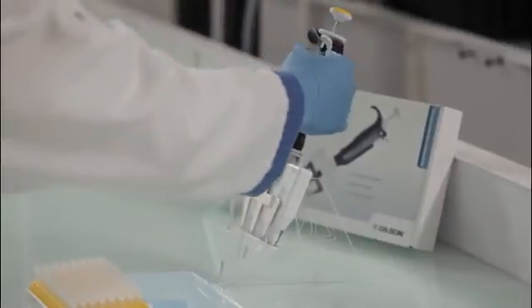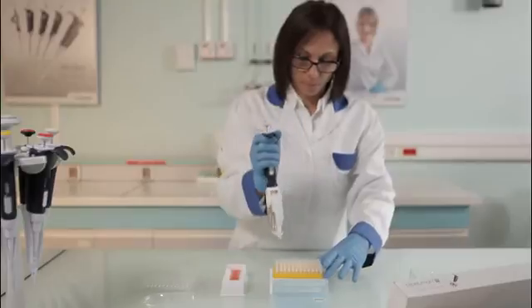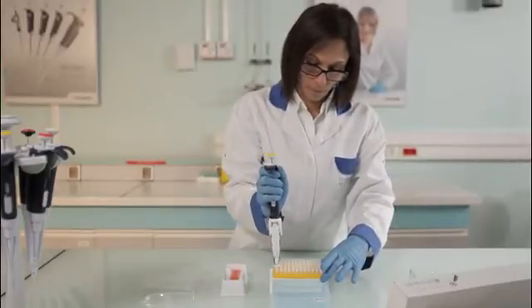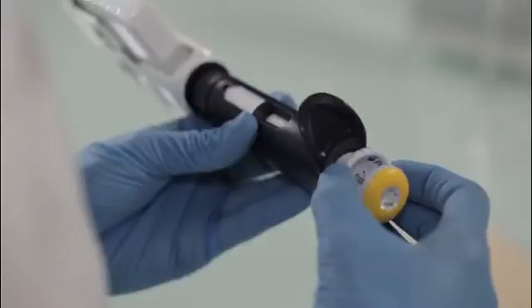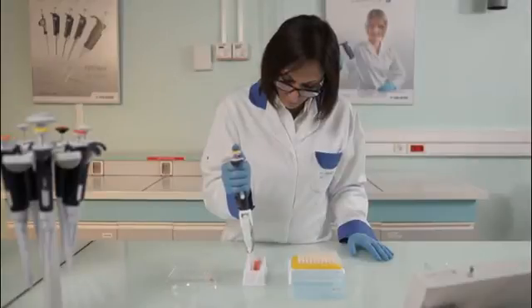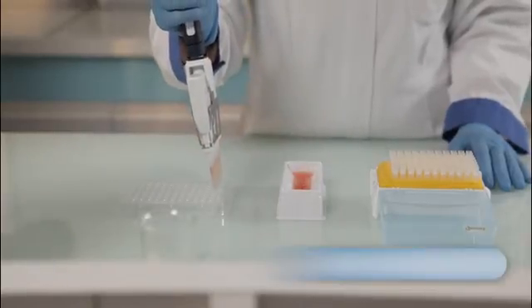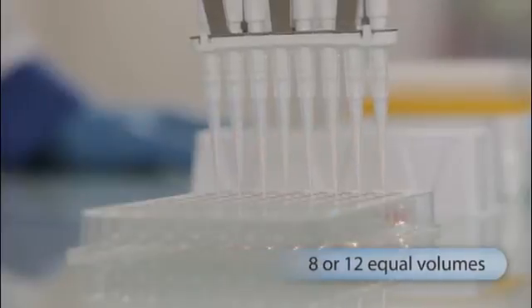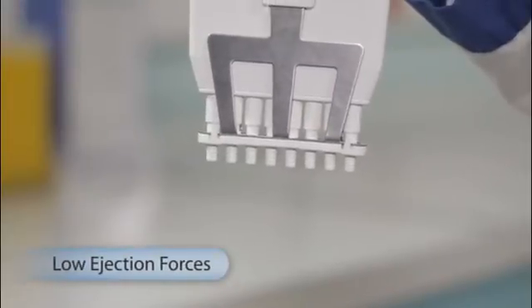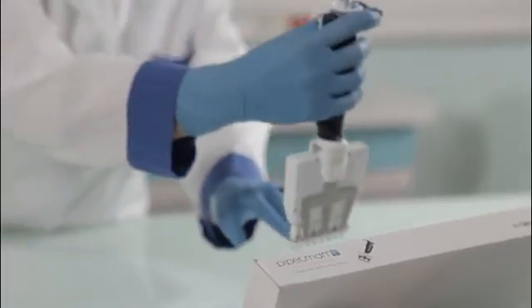For applications with microplates, you can enjoy PipetMan L benefits with multi-channel models. This multi-channel pipette has an exclusive piston drive mechanism to secure results with no disparities of the dispensed volume and to decrease pipetting forces. The tip ejection forces are also reduced thanks to a unique ejector spacer.